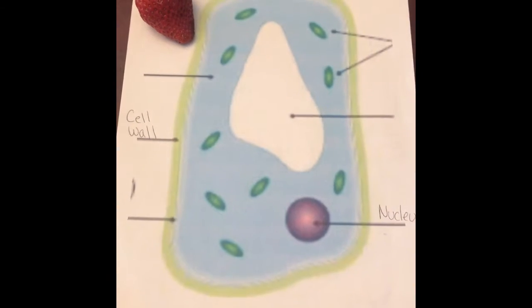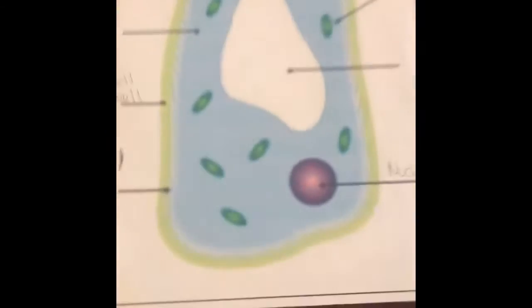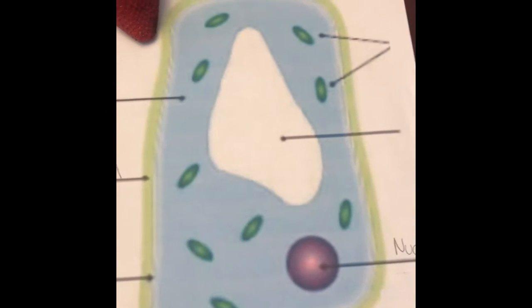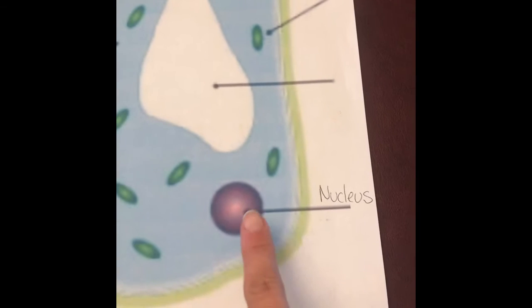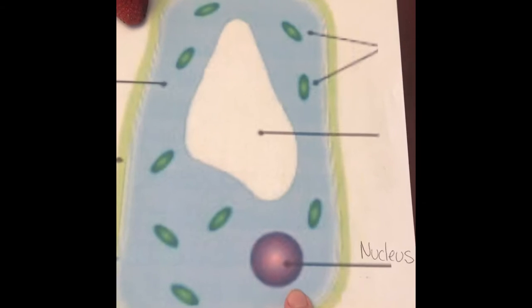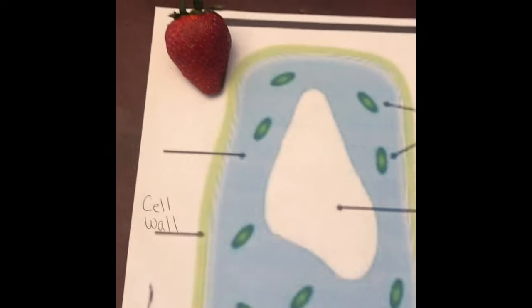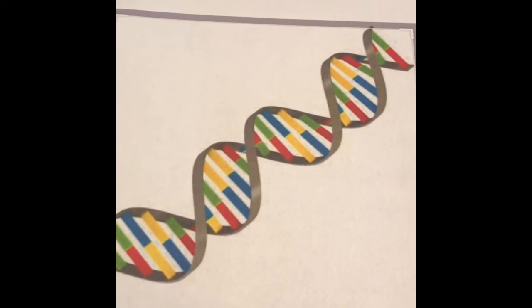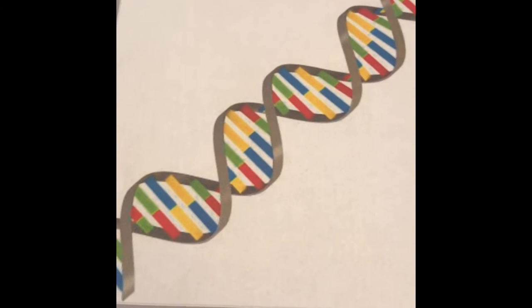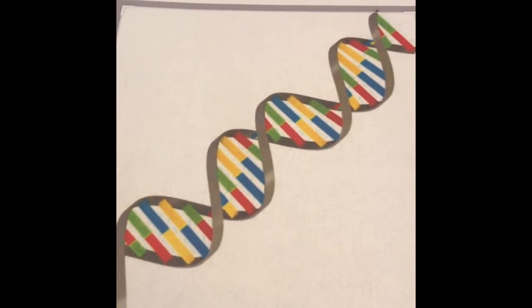This is a picture of a plant cell. Strawberries are plants, and they have a cell wall, that's the green rectangle going around, and there's a nucleus. Inside the nucleus is the genetic code or DNA instructions of how to make a strawberry. Here's a picture of what a DNA molecule chain looks like. And I'll show you our ingredients of what we're going to be doing today.